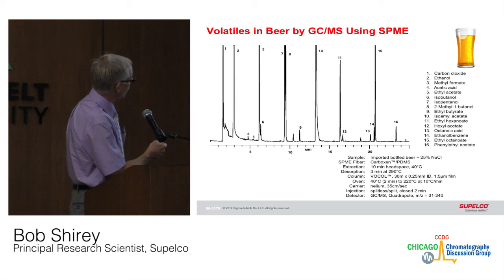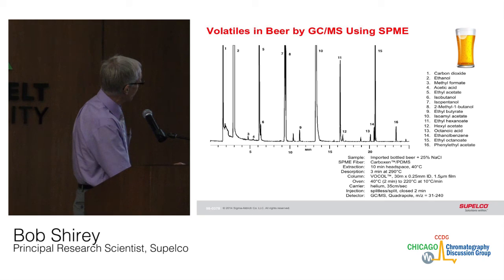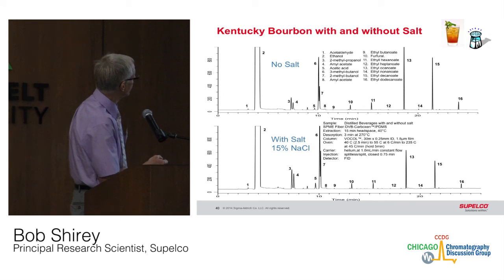Same thing with beer. Pick up carbon dioxide. I did not degas the beer before analysis. And you can see we got a lot of, again, similar components that are in the wine from fermentation, but obviously different amounts. And again, the carboxen fiber was used.